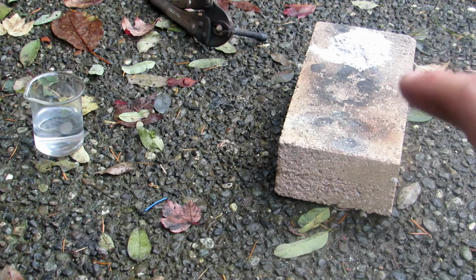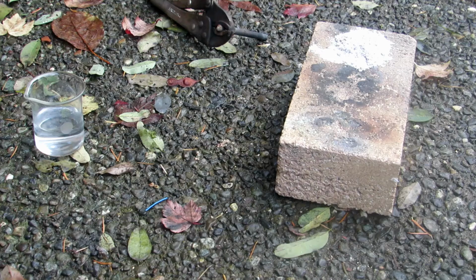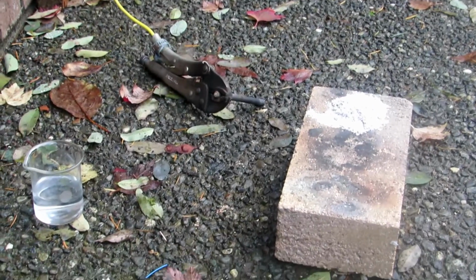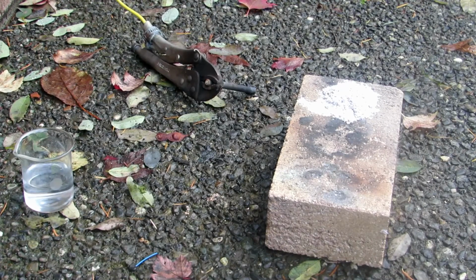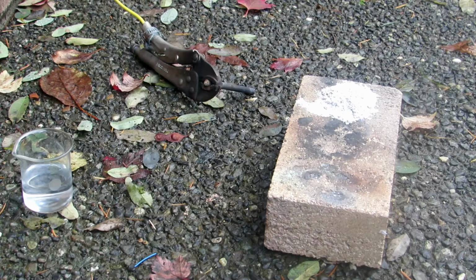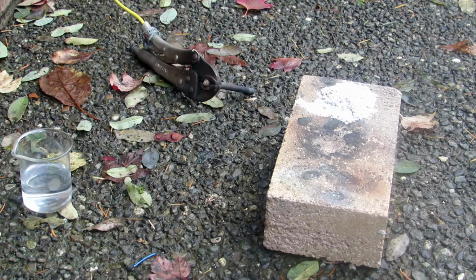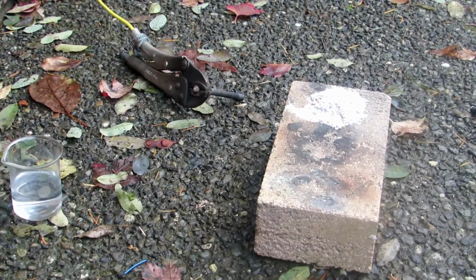So this reaction is going to be releasing carbon dioxide and forming potassium oxide. The potassium oxide must be worked with very rapidly, as it will rapidly react with both carbon dioxide and water in the air, and can easily convert to other compounds which we do not want. So I will now go ahead, set up my arc furnace, and start electrifying this at very high temperatures until it, I guess, all converts to potassium oxide. There's not going to be a real huge indicator that's happening, and I've never tried this before, so this will be interesting. So, yeah, I'll go do it.